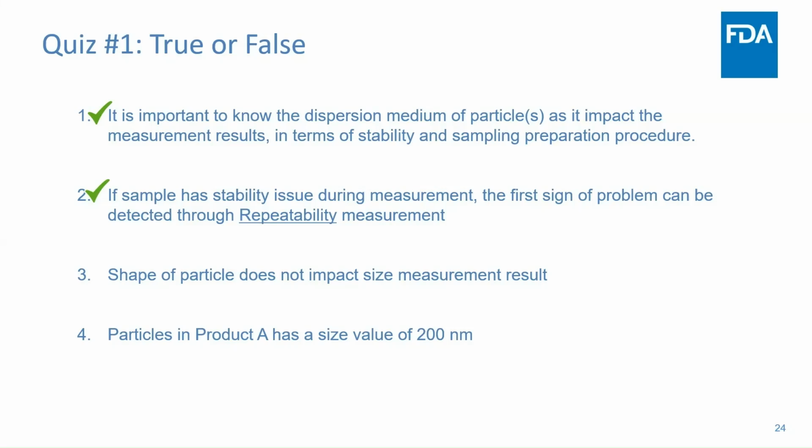And that's also the reason why we really encourage the company to properly validate the method by showing the repeatability of the method. And the third question: shape of the particle does not impact size measurement results. Is that true or false?